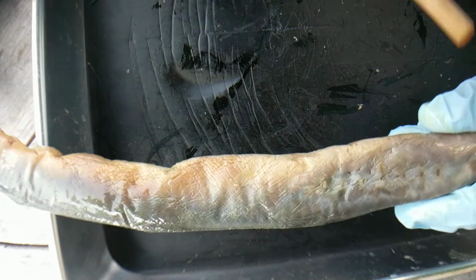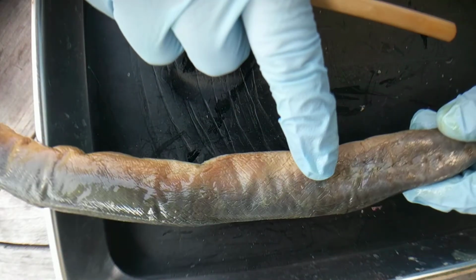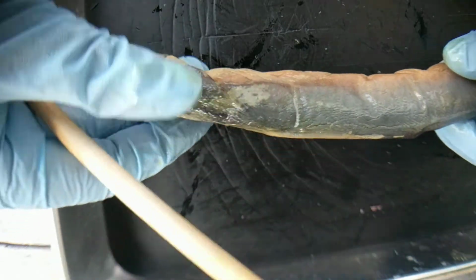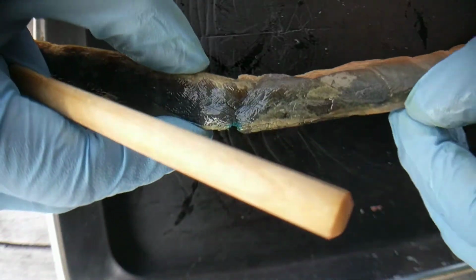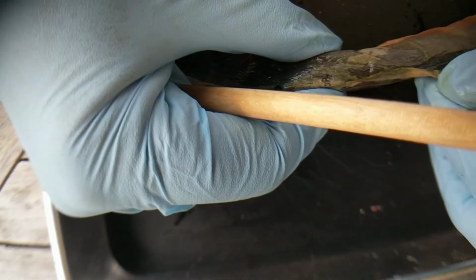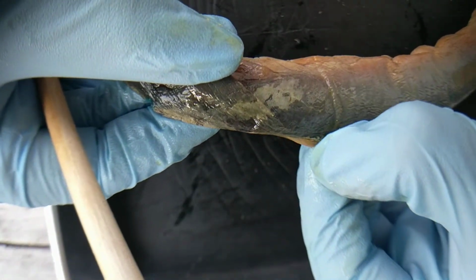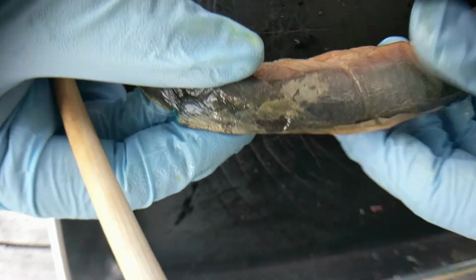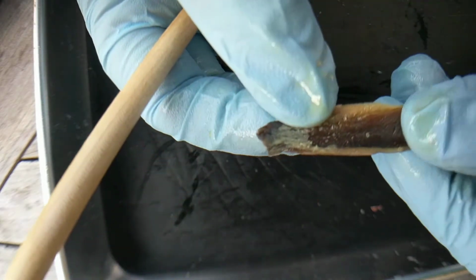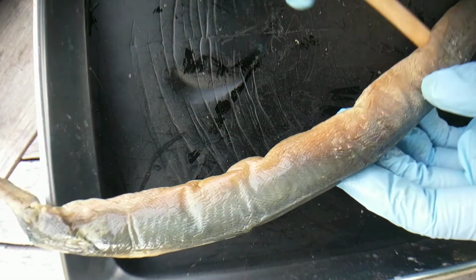And notice that there's no pectoral fins. There's none of the paired fins that more derived fishes have. But they do have a dorsal fin. Again, this has been vacuum packed, so let's see. There it is. Okay, so there is a dorsal fin. If you see the pictures in life, you'll see it's bigger. And then there's a caudal fin as well. So you can see on the back, this is the fin raised. The main part of the body is called the trunk.